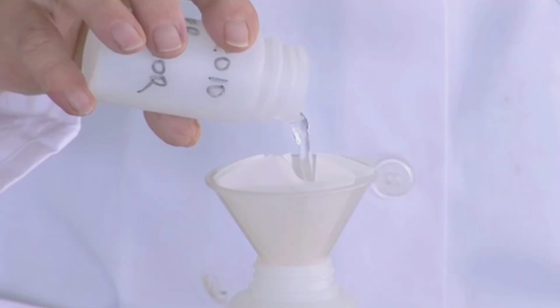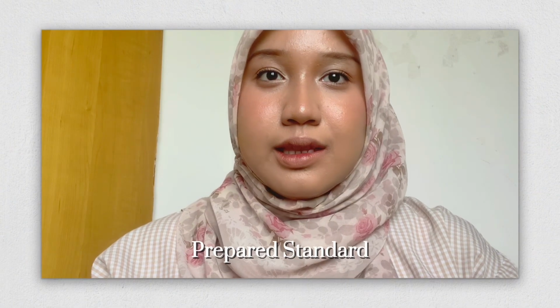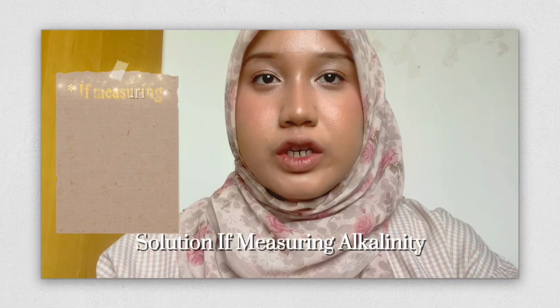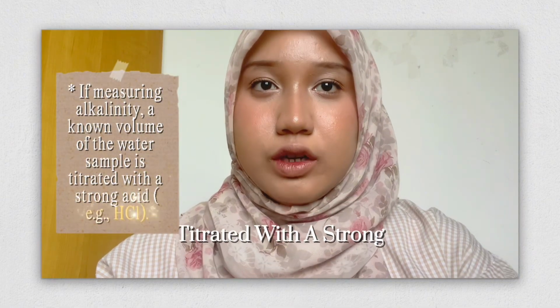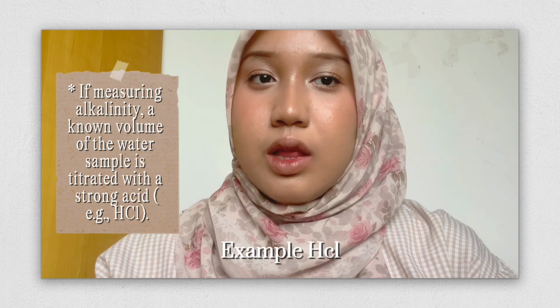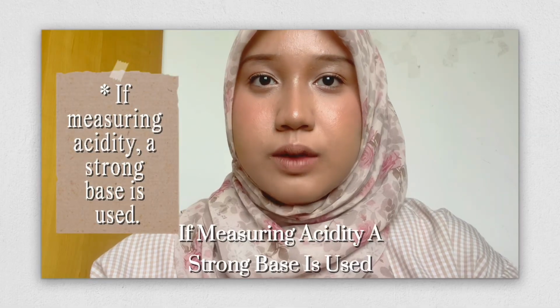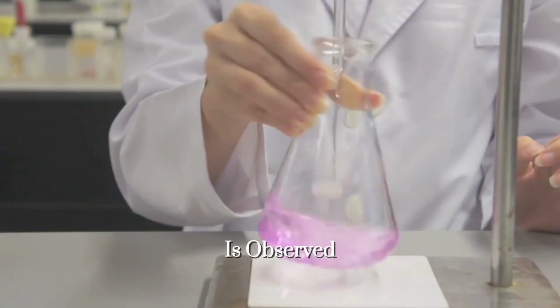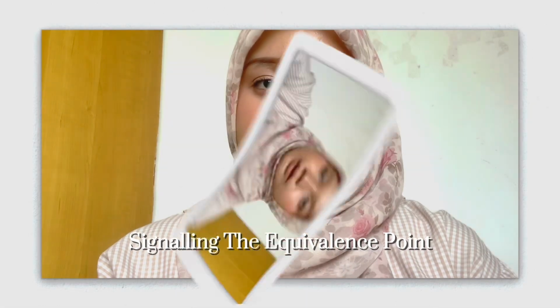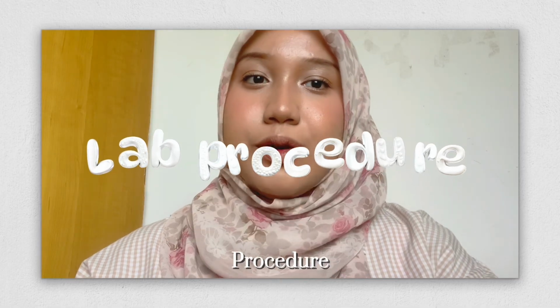Number 3. Acid-base titration process. The collected water sample is titrated against the prepared standard solution. If measuring alkalinity, a known volume of the water sample is titrated with a strong acid, for example HCl. If measuring acidity, a strong base is used, while the titration continues until a color change is observed, signaling the equivalence point. Here is an example of a simplified lab procedure.